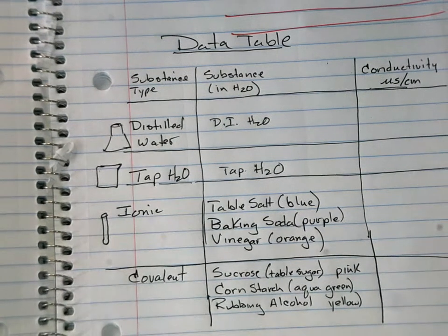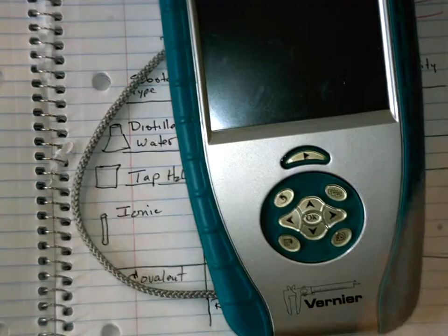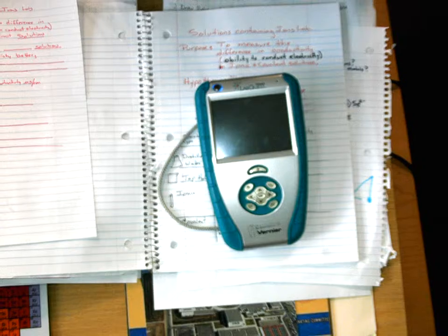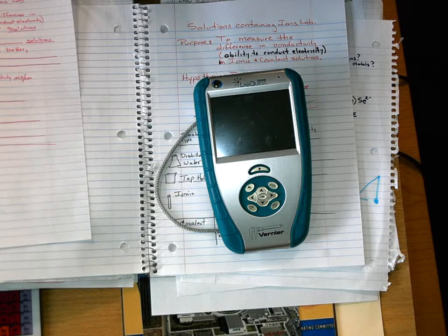Okay, so we've got our lab set up. I've got to stop the music now because I will start singing and I cannot sing. So I'll play it later.